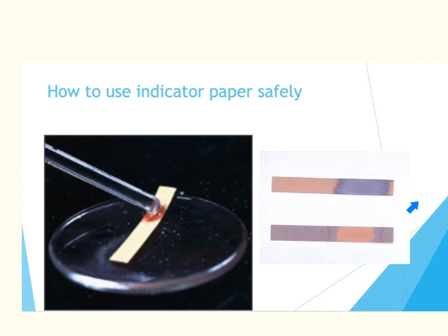This is litmus paper. Red litmus paper turns blue in the presence of a base, and blue litmus paper turns red in the presence of an acid. To use it, take a watch glass and place your filter paper or pH paper on that watch glass. Take a glass stirring rod, dip it in the chemical you want to test, and then touch the test strip while it is on the watch glass. This allows the chemical to contact the strip without ever coming in contact with your fingers. If you dipped the strip directly into the chemical, it would soak that chemical up and touch your fingers — so this is the proper way to use indicator paper.